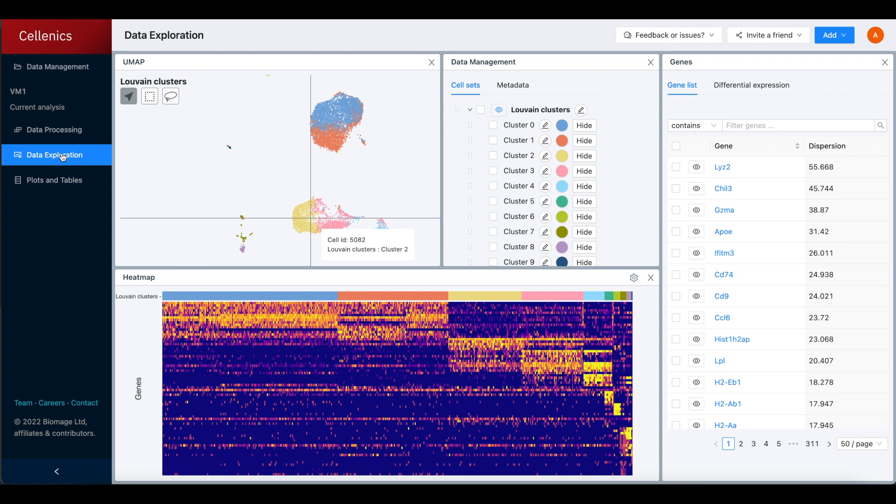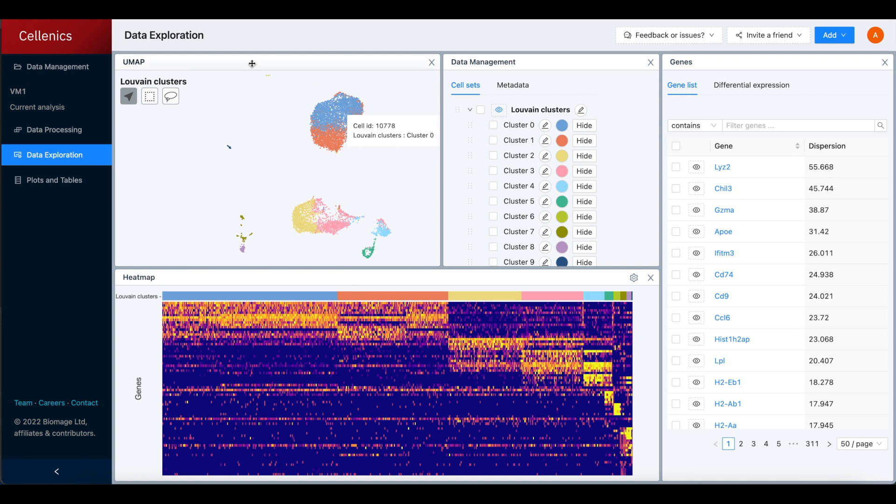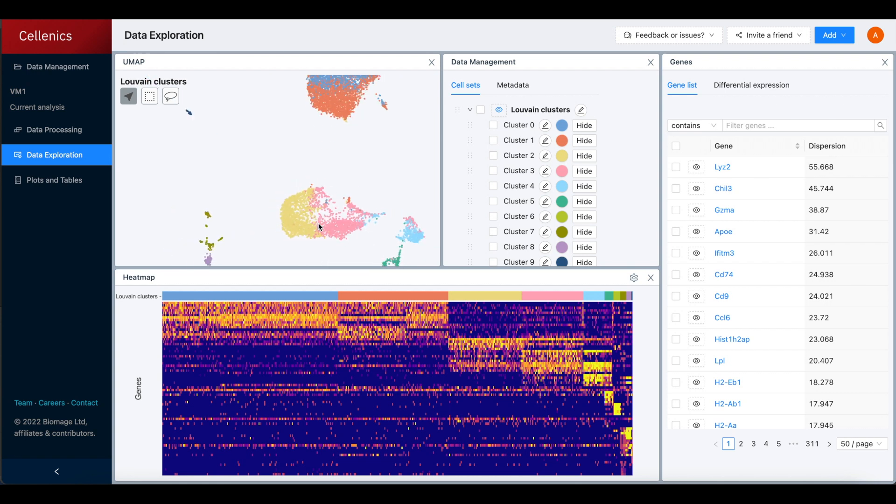The data exploration module is where in-depth analysis of gene expression and differential expression is performed. On the left, we have the UMAP or TISNI embedding that was customized in the final step of data processing.